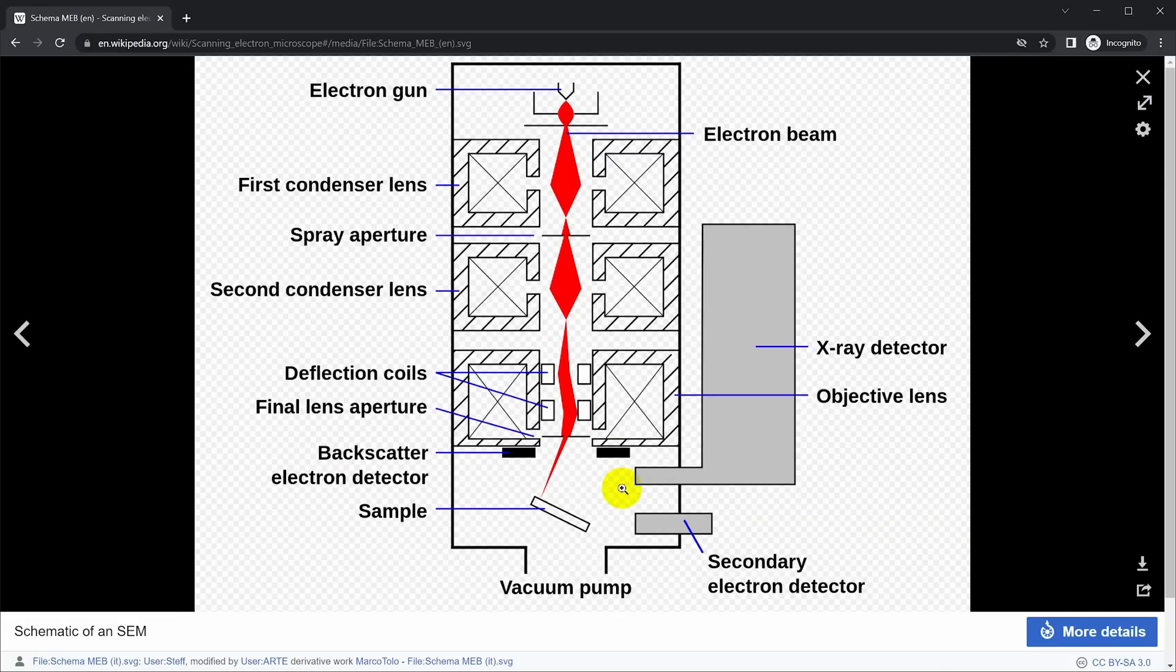The microscope typically has multiple detectors. You have a back scatter detector that's usually an annular ring around where the electron beam comes out that catches back scatter electrons that come straight back. And then you have electron detectors off to the side and x-ray detectors and other kinds of current detectors that will catch electrons that are coming out at low angles or x-rays coming out of the sample or just the current being conducted through the sample. And all this information can be used to create an image.